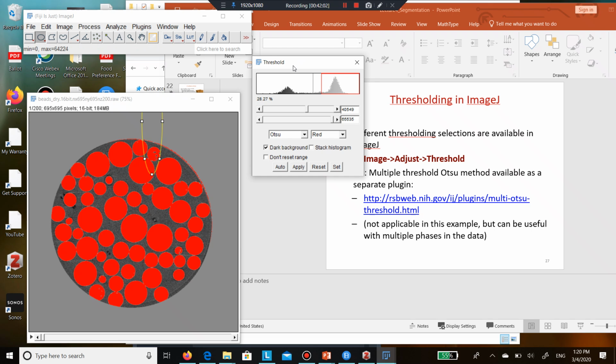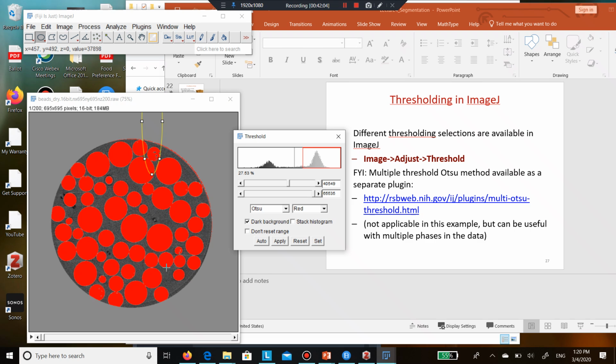Because that would be a problem. I'll take a look. That's the thing with clicking: it's nice, but also if you click on something, yes, threshold is a histogram. It's an image. As far as ImageJ is concerned, it's an image.